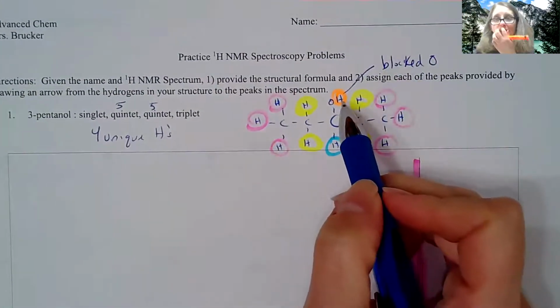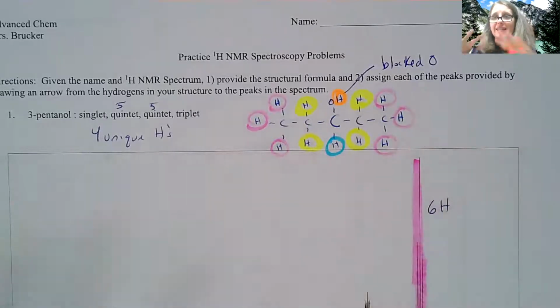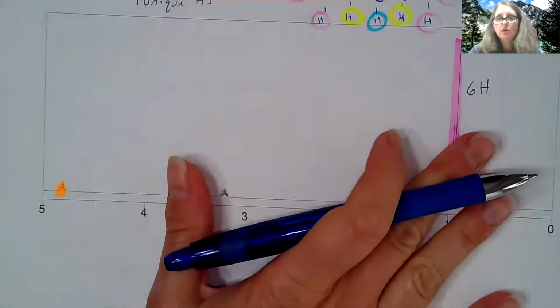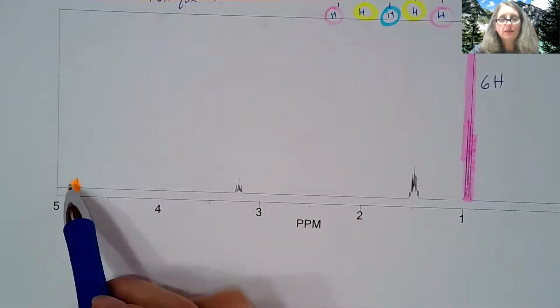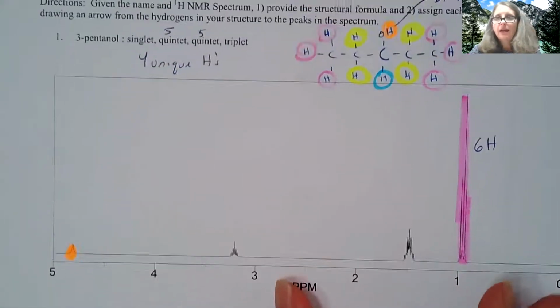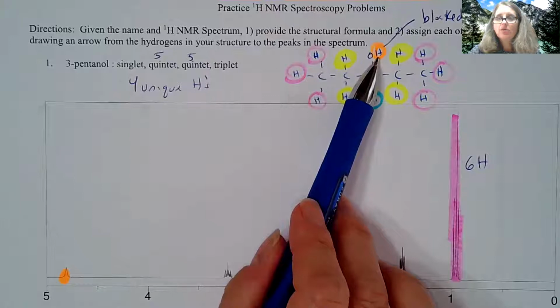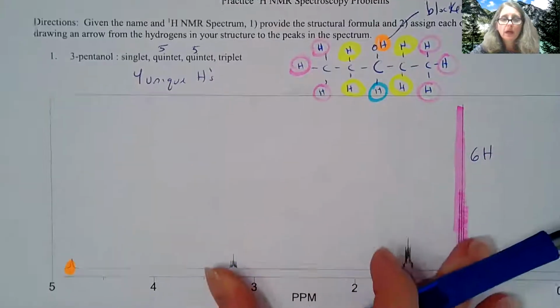So the hydrogen that's always on any alcohol, that hydrogen can't see any neighbors, okay? So it's screened away from that. So anytime you see a singlet somewhere here and it has no other place, it's got to be the singlet that is from the hydrogen on the OH.